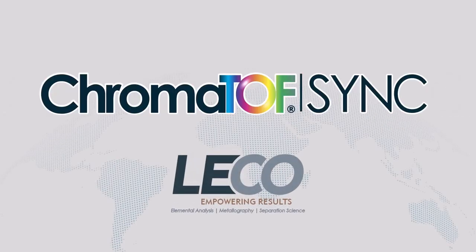LECO's ChromaTOF Sync is an advanced peak finding tool for processing sets of Pegasus BT data. With full peak finding and deconvolution, the software generates a combined peak table for multiple samples, simplifying non-targeted characterization workflows.